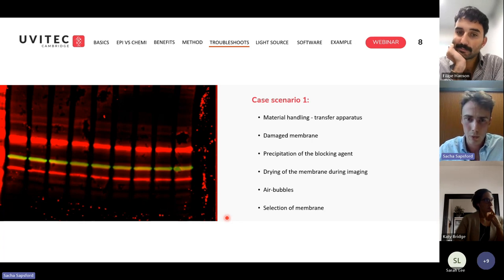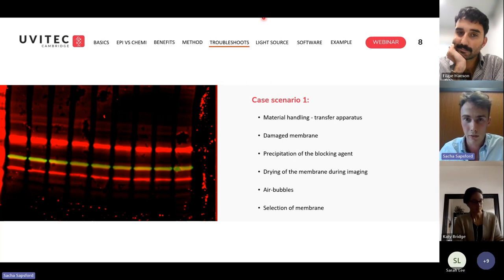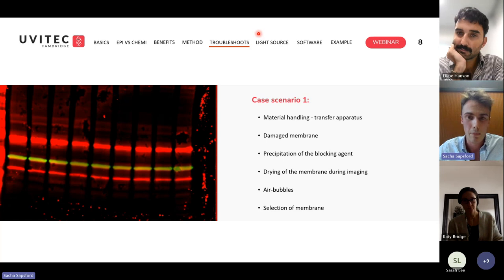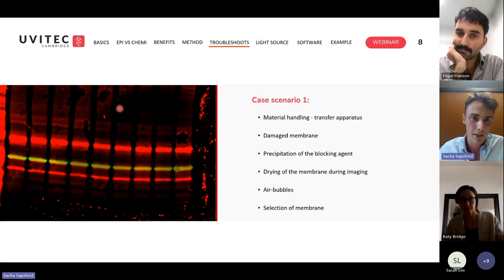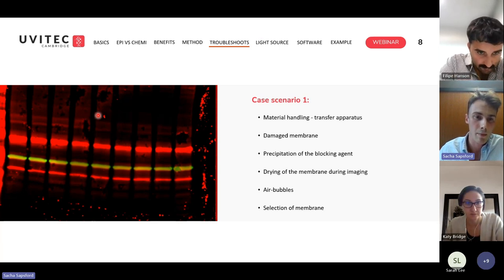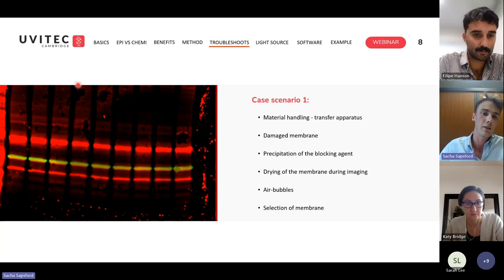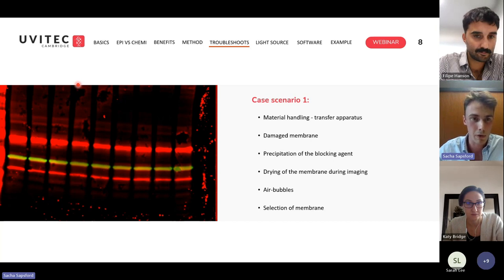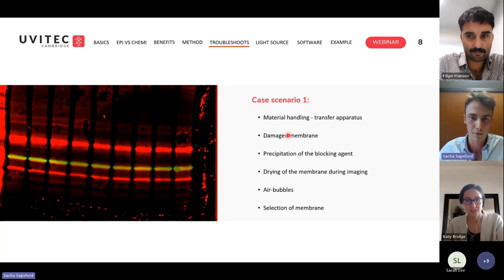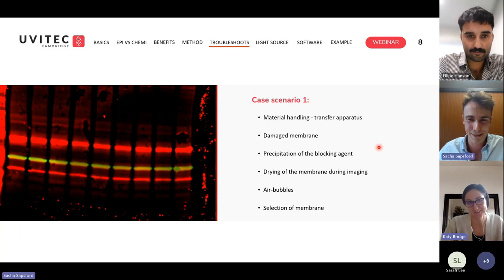Now for two case scenarios. In the first, we can see dark holes in this blot — done in the US, where the scientist was quite surprised. I invite you to guess: is it air bubbles, membrane touching, transfer pad issue, or something else? Katie's guess was air bubbles — not bad, that was my first thought too.